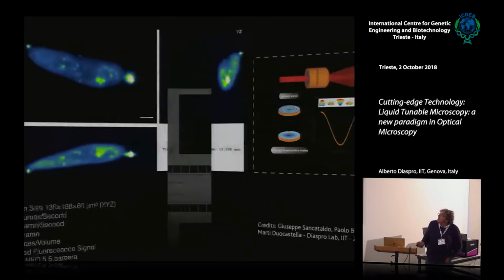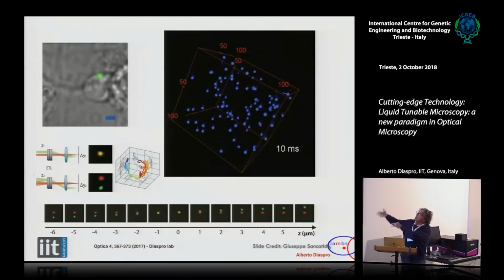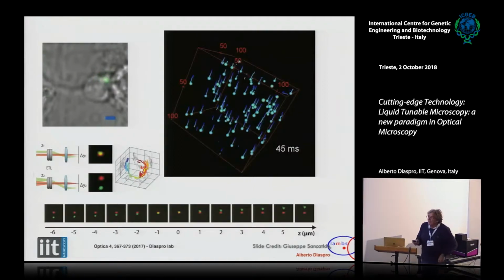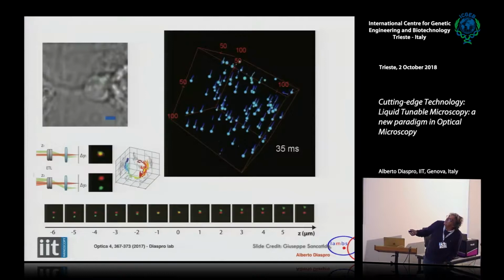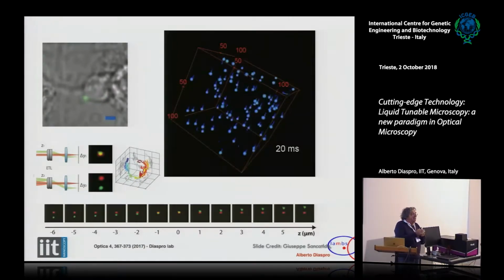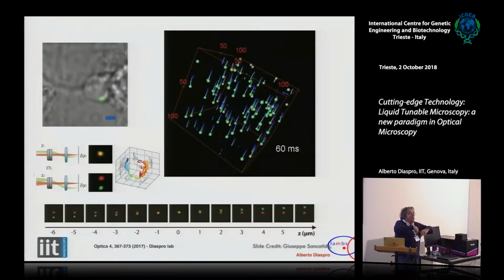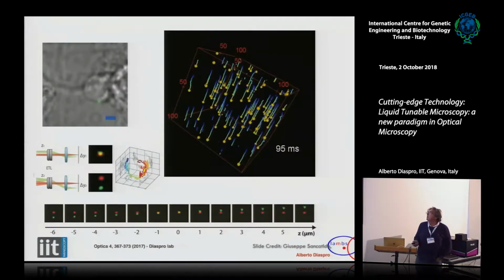So it's not bad. And since you have in your hands this possibility of shaping the beam, of misaligning or realigning the beam and working with a liquid lens, you can use this displacement to follow in three-dimensional space single molecules, like in this case. This is a quantum dot moving across the periphery of a cell, and you can detect it with nanometric precision. So we can shape the beam, we can control the scanning, we can do everything. We have the green fluorescent protein, so we have a lot of tools in our hands. And now we are interested in resolution.